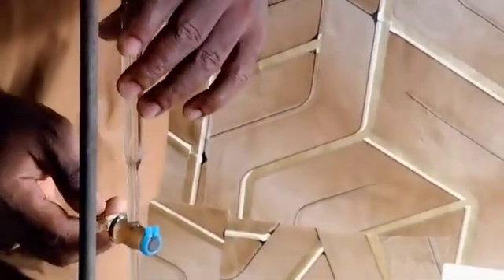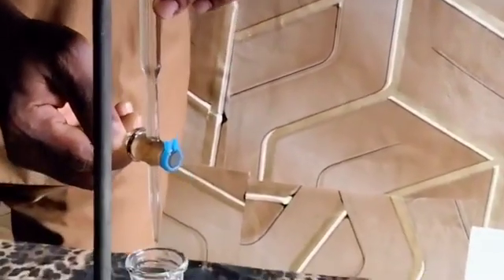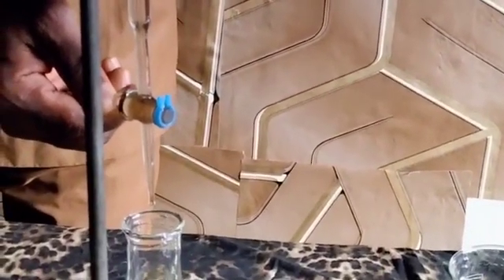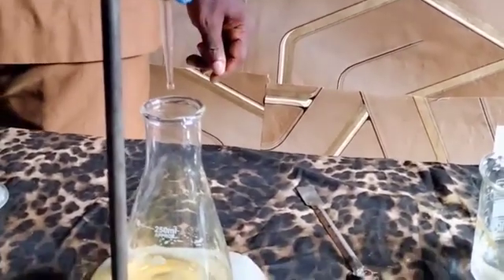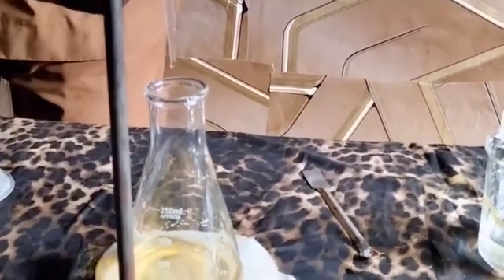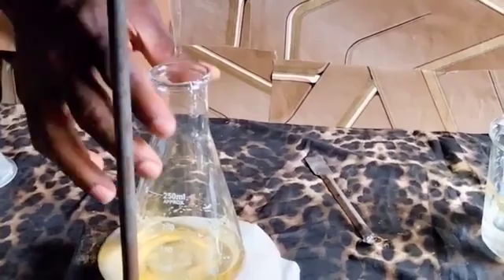We now close the tap so that it will go in gradually. We'll pause it at 21 and then take it drop by drop until we have an accurate color change. So we'll now close the tap and then shake it.